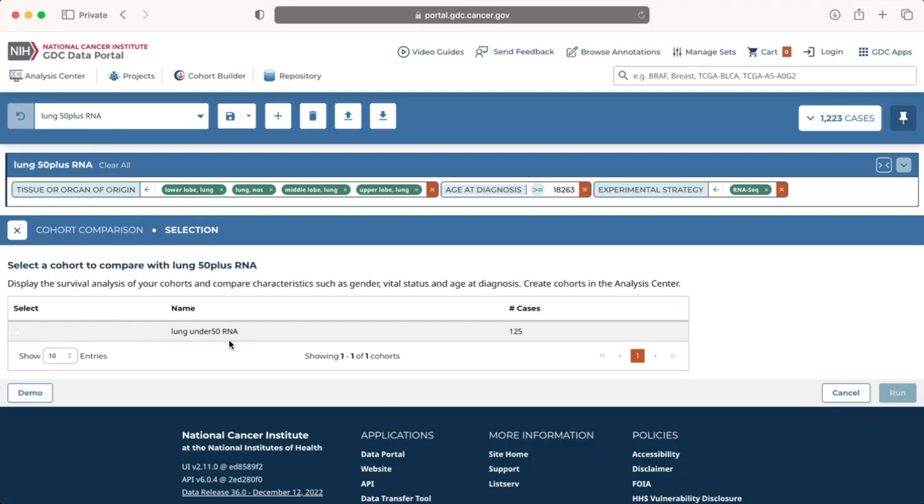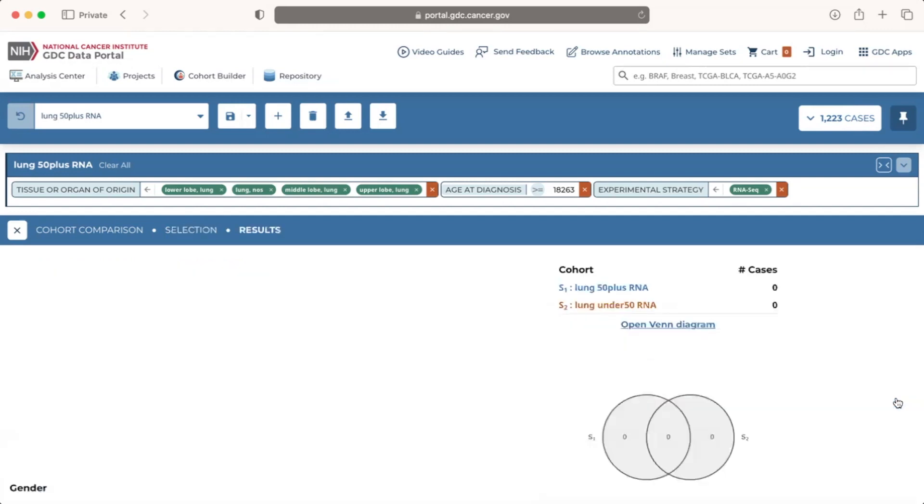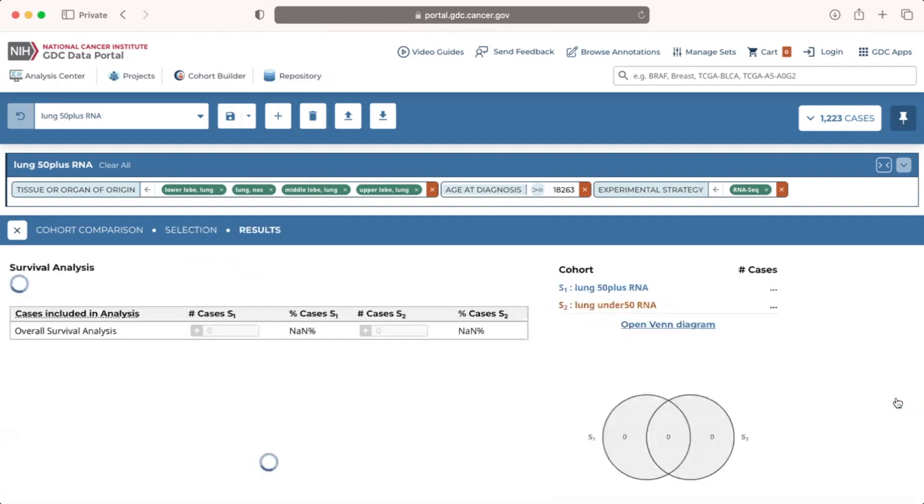Since there is only one non-active cohort, we will select the cohort of under 50 lung cancer cases with RNA-seq data. If you have other saved cohorts, you can choose any of them to compare with your active cohort by clicking the corresponding bubble in the Select column. Once we've selected the cohort which we want to compare with the active cohort, we will click the teal Run button in the bottom right corner.